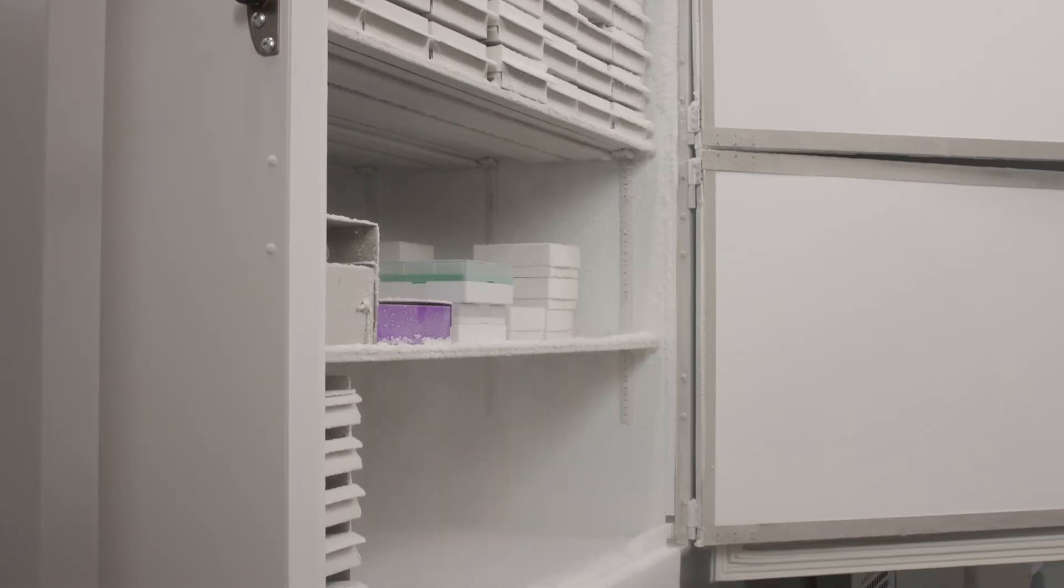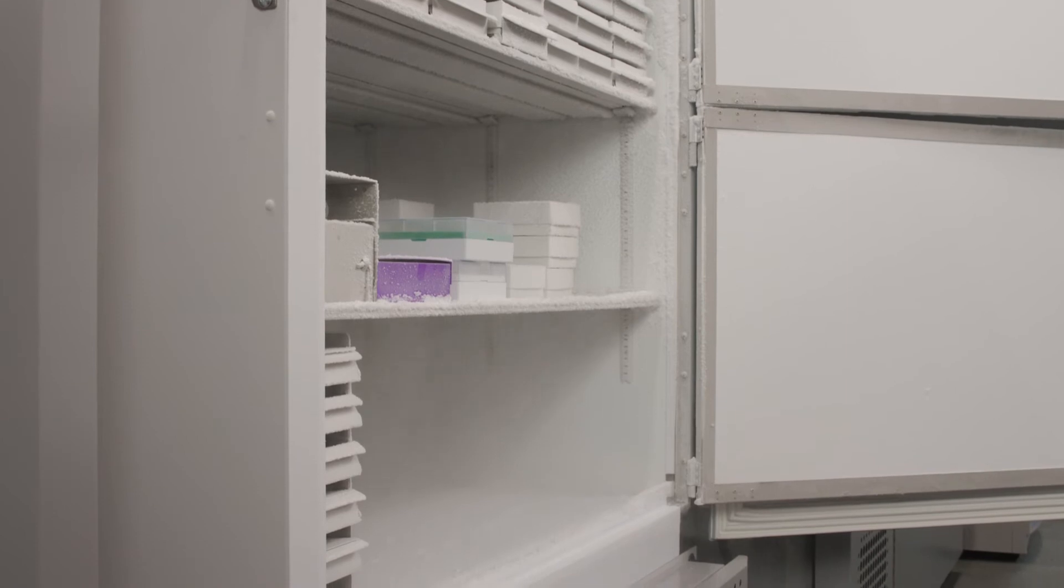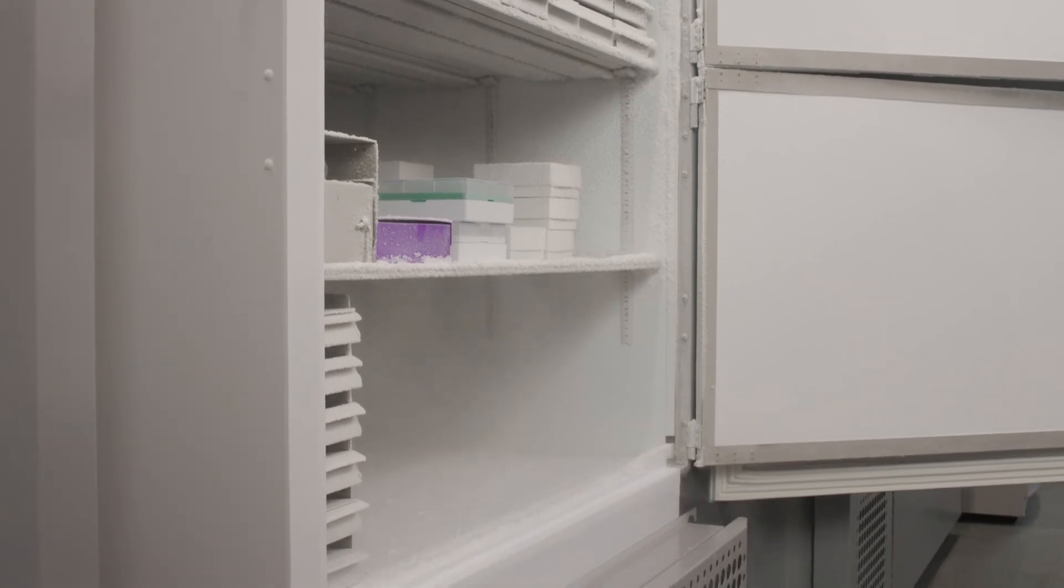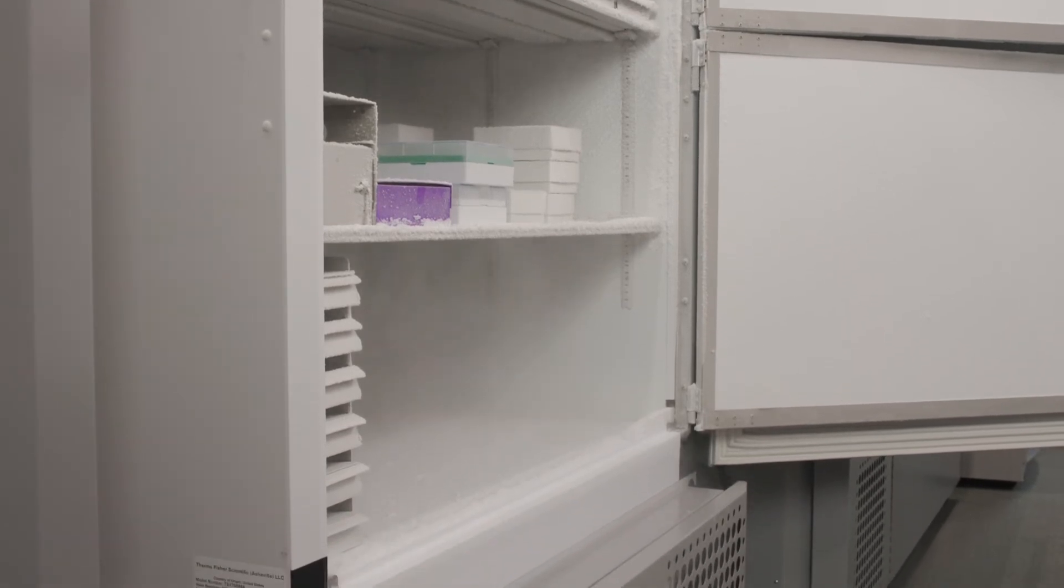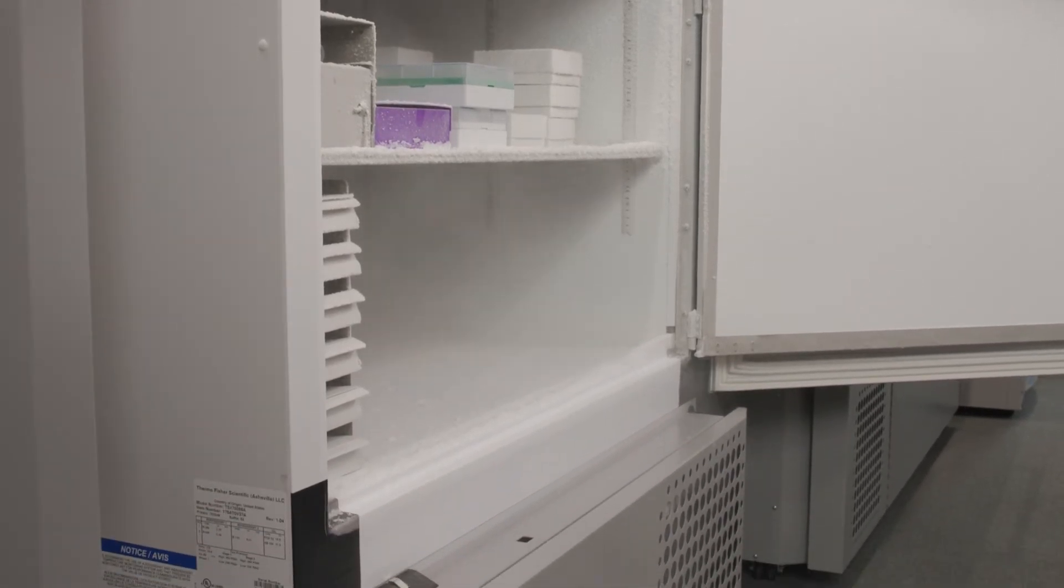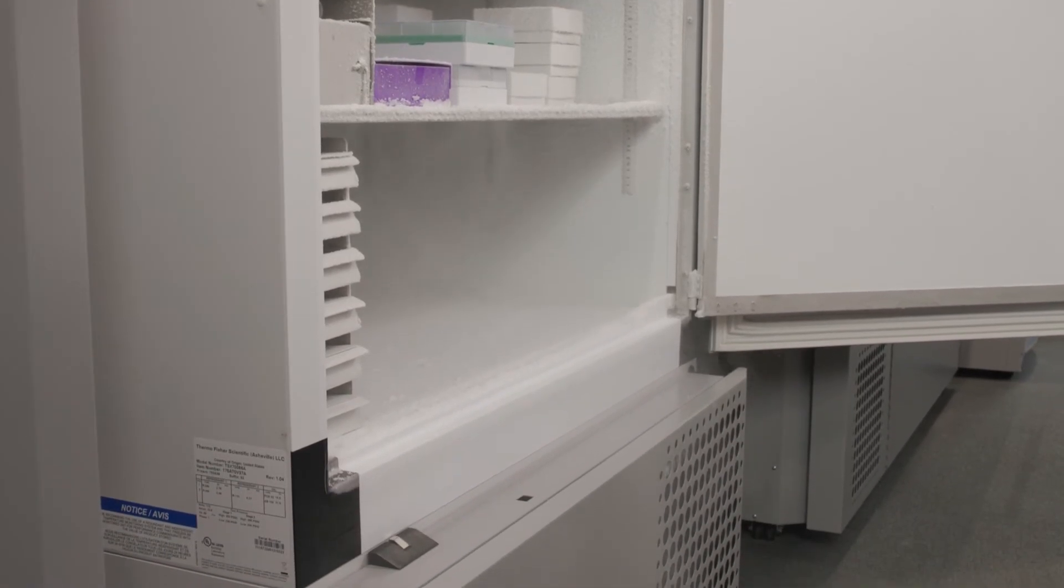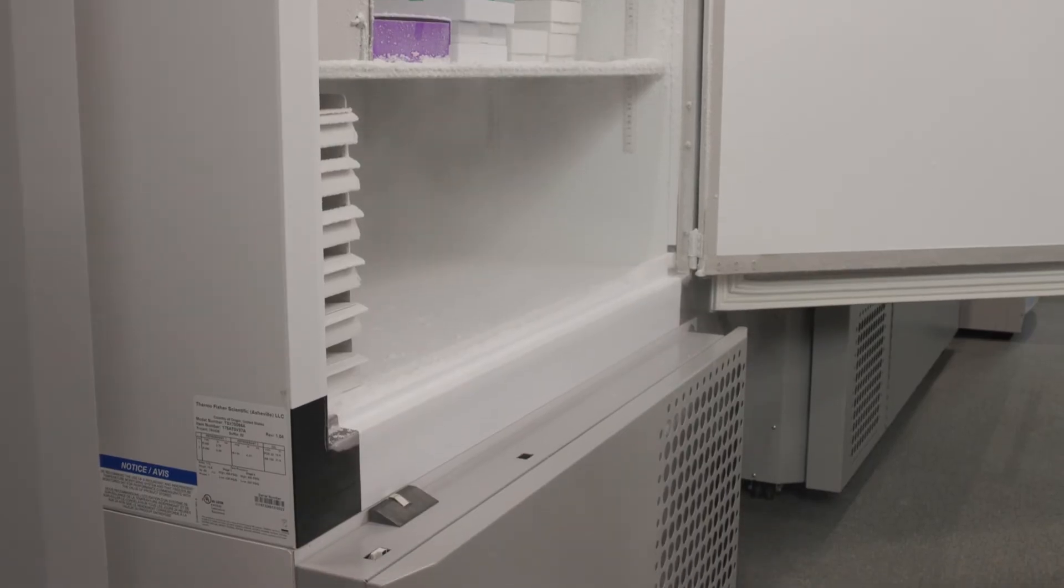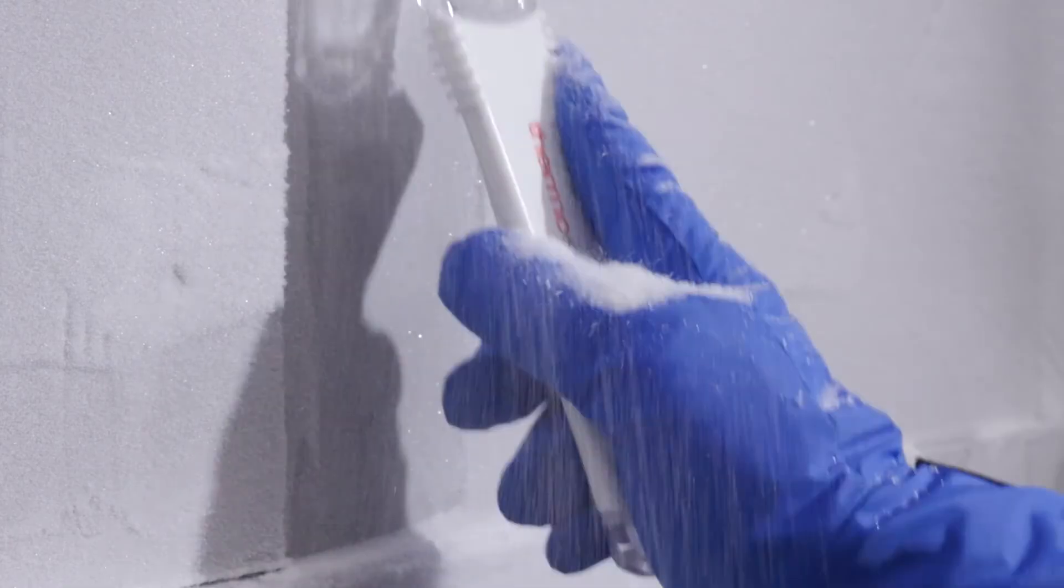You can help reduce frost and ice by having a plan before you enter your ULT freezer. Keep the doors open for as short a time as possible. It also helps to clean out any noticeable ice buildup or frost with a scraper as often as you can, even if it's just a small area each week.